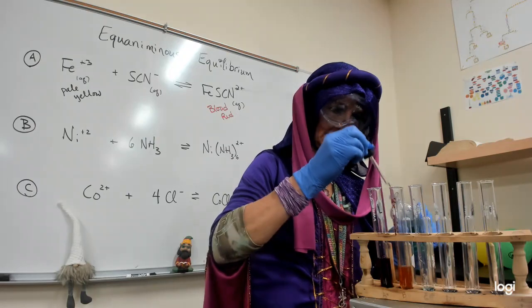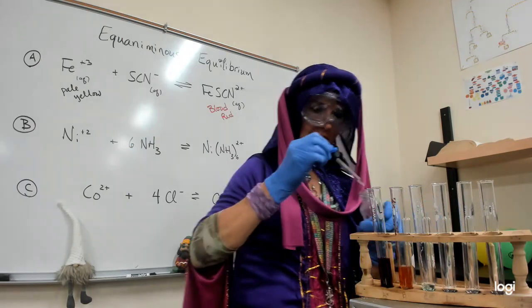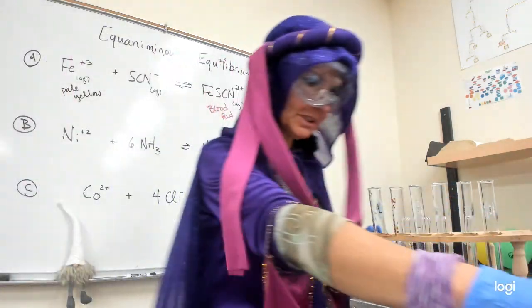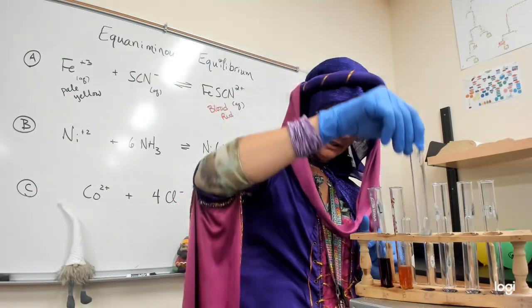Did you count? Was that 10? Let's do 20, because I'm feeling lucky today. And then we're going to add a few drops of NH3. So, it's kind of a periwinkle green, a light green.